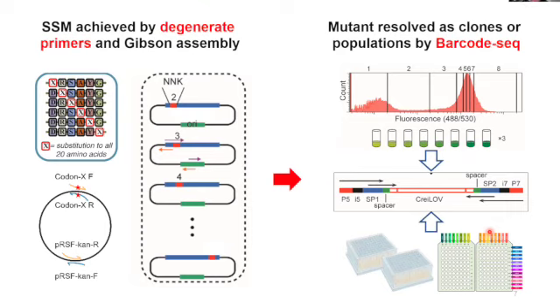On the other hand, sometimes the phenotypes cannot be directly linked to fluorescence or growth, for example, chemical production. That's where we probably need to dereplicate these mutant libraries into clones and put them into 96-well plates, and then use PCR to introduce DNA barcodes that encode the physical locations, basically which well or which place, barcoding that information into the DNA. So after pooled sequencing, we can trace back to where each mutant is from.